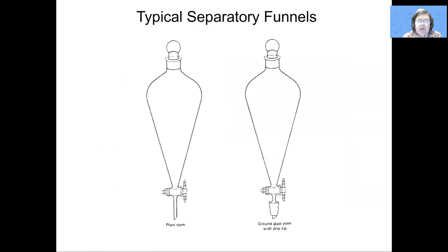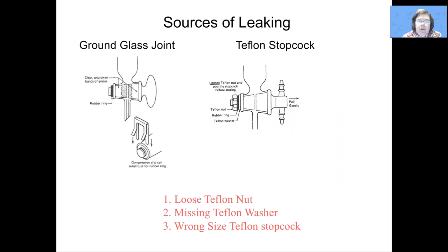There are many different kinds of separatory funnels. Here I show one with a plain stem and one with a ground glass stem. When we put our separatory funnel together, it can leak either from the top, from the lid or the stopper. In that case, what we would do is take out the stopper, inspect it, clean it, and then reinsert it with a slight twist to get a good seal. If it still leaks from the stopper, then you probably have an incorrect stopper and you need to go find the right one that matches that particular separatory funnel.